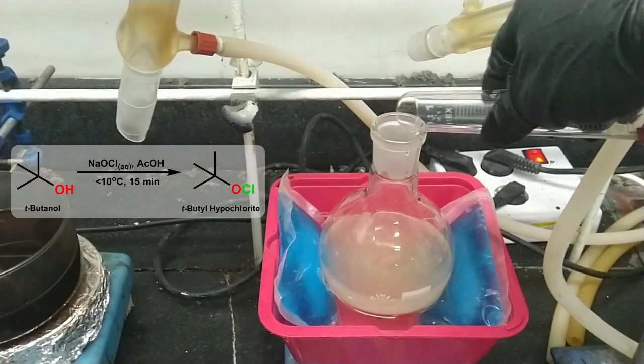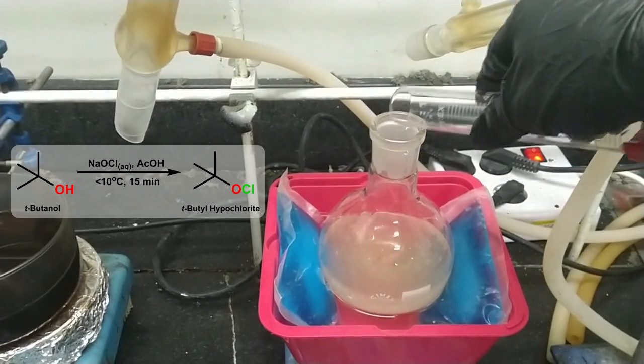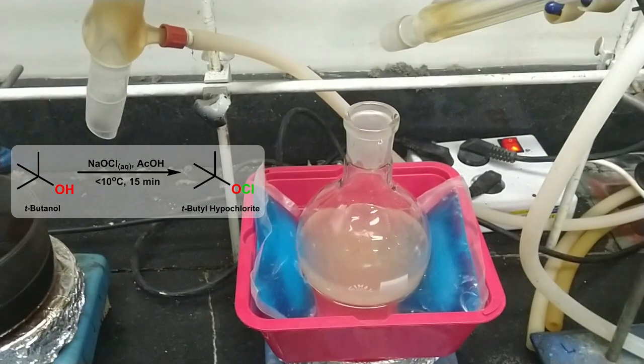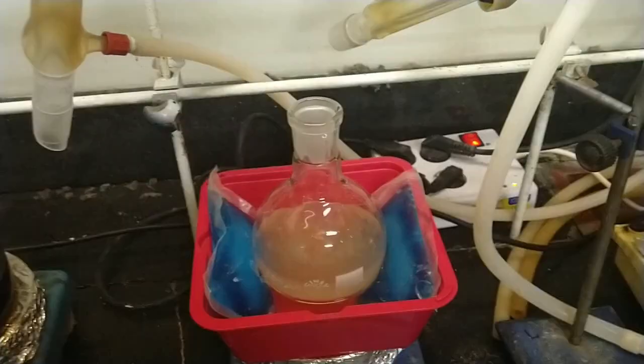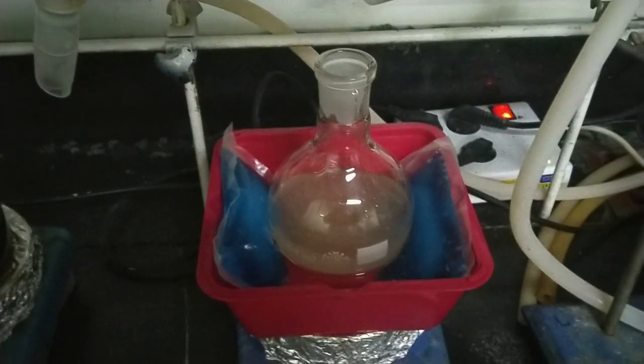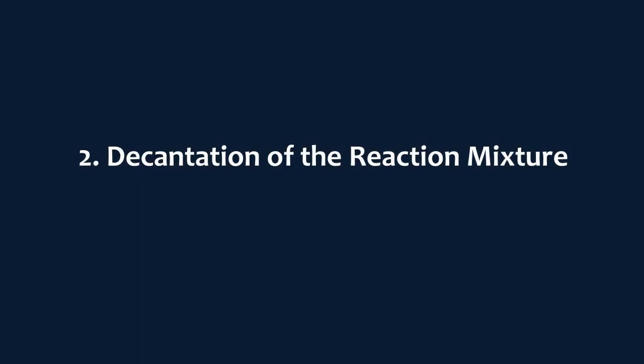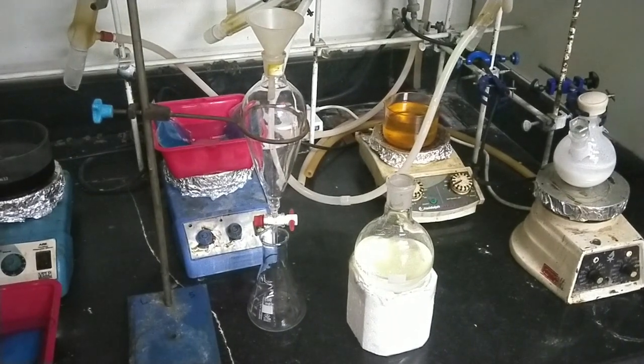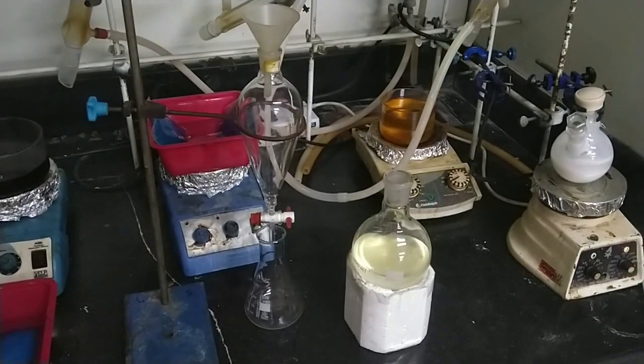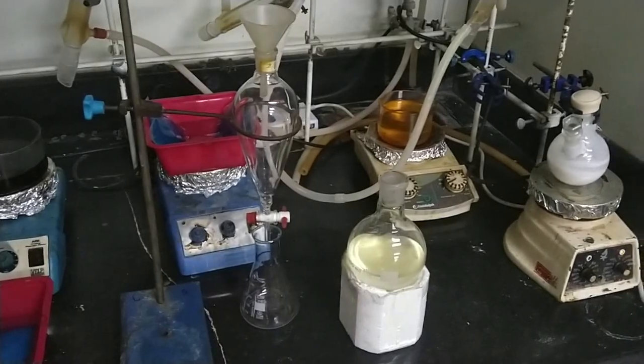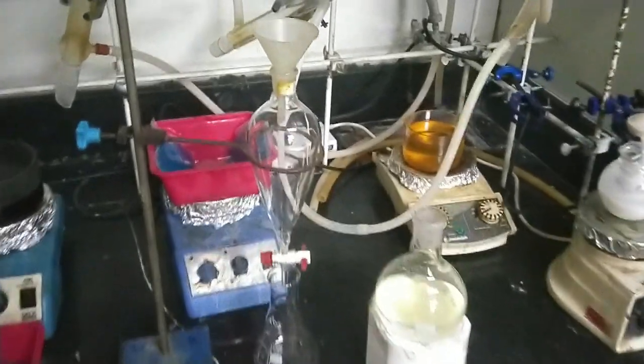After adding that, I turn out the lights because the product is light sensitive. Here, after 15 minutes, the reaction mixture is ready to be decanted, so I pour it into a decanter.